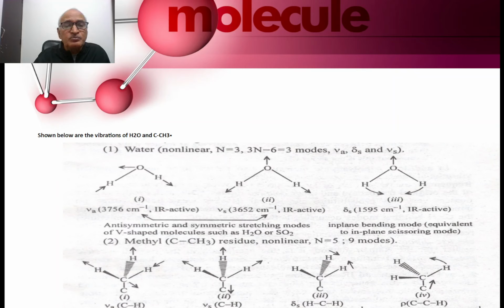For a methyl group connected to a carbon, because the number of atoms is more than 3, both in-plane and out-of-plane vibrations are possible. You see, the diagram nicely explains the meaning of in-plane and out-of-plane vibrations. The values are also given.